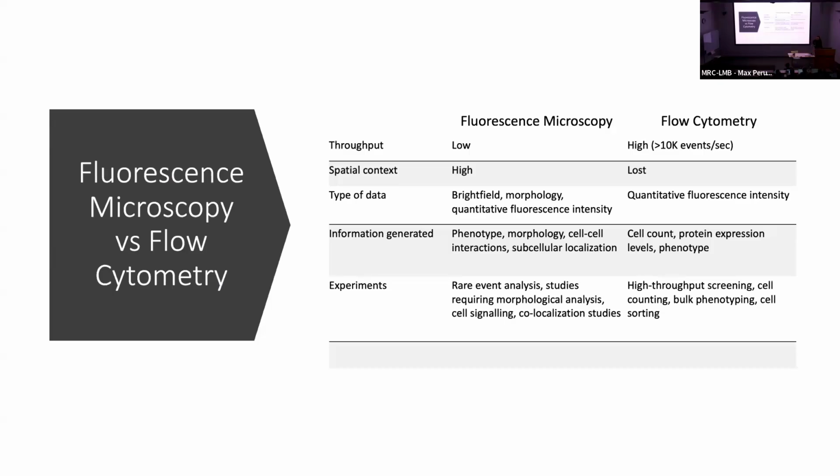Whereas microscopy is the superior choice when the research question requires any kind of visual or spatial context. So I've tried to summarize the differences here.